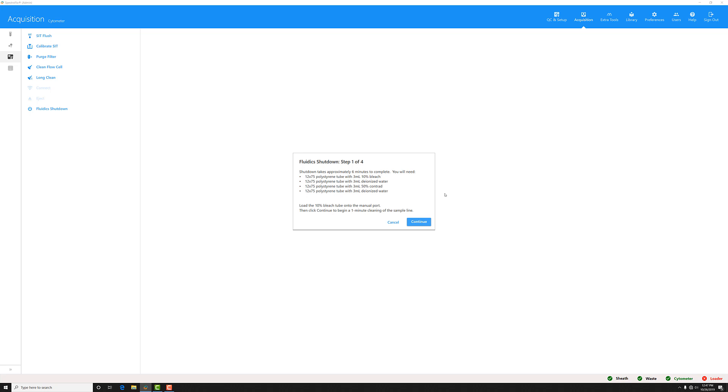You'll need to make four tubes: one with three mLs of 10% bleach, one with DI water, one with a diluted Contrad mixture, approximately 50%, and another tube of DI water.